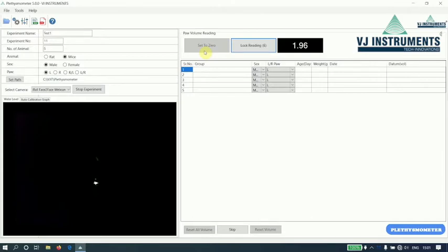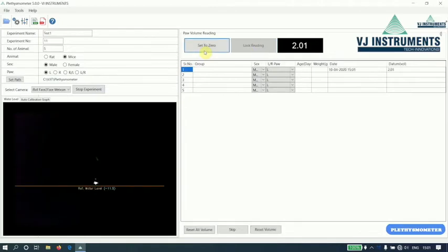We have inserted 2CC cube and we have got a reading almost equal to 2.01. So this conveys that our calibration setting that we have done is correct.